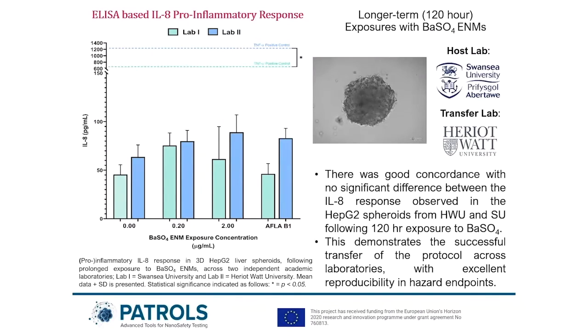As is seen in this figure here, there was good concordance in the negative untreated control, with no significant difference between the IL-8 response observed in the HepG2 spheroids from Heriot-Watt Uni and Swansea Uni following the 5-day exposure to barium sulfate. Both of these trials demonstrate the successful transfer of the protocol across laboratories with excellent reproducibility in hazard endpoints.